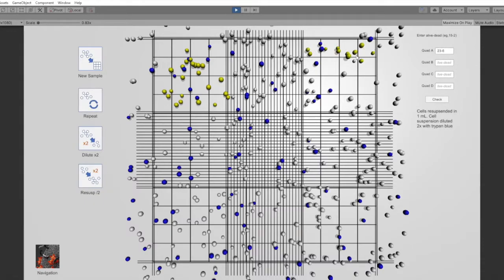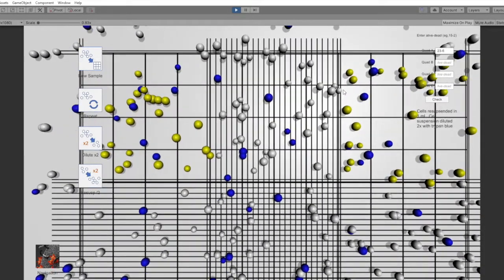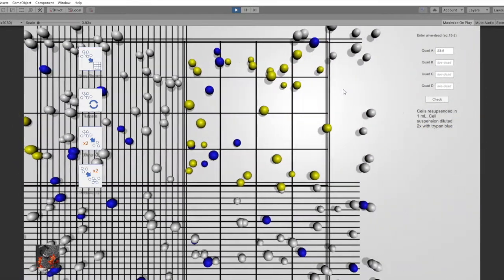Again, this clicking and being able to mark the cells with the yellow dye is a very useful way of determining what you've done and what you haven't done. We can zoom in and scan around, which is very, very useful, so we can actually look to see which balls are on the line and get a better view of things.